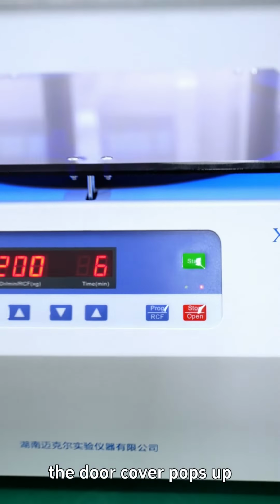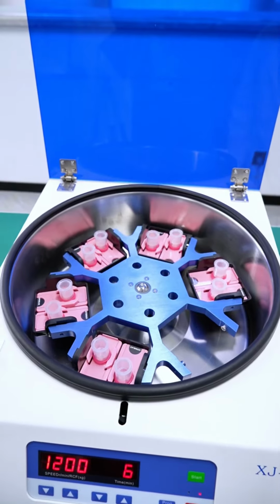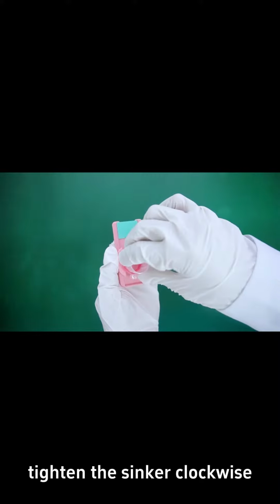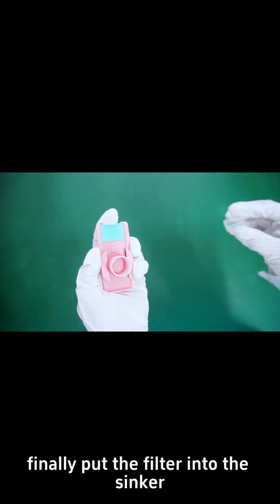The door cover pops up. The machine is equipped with a horizontal rotor 12 slide holder. Push the slide into the holder. Tighten the sinker clockwise. Finally, put the filter into the sinker.